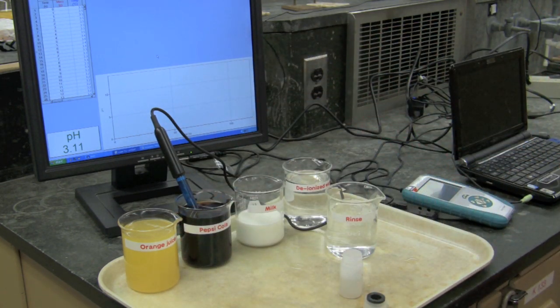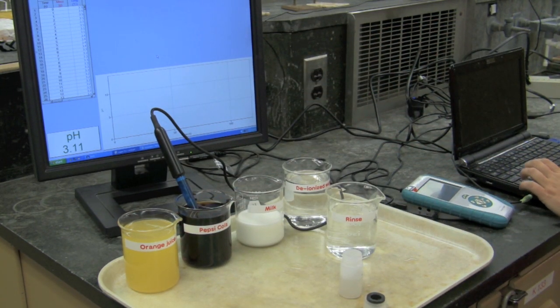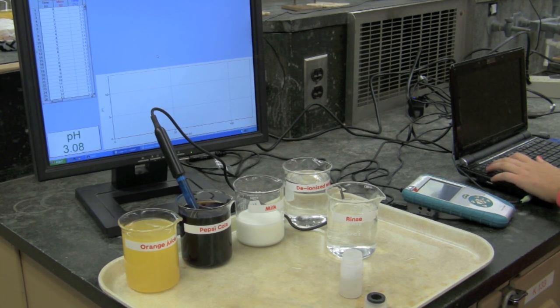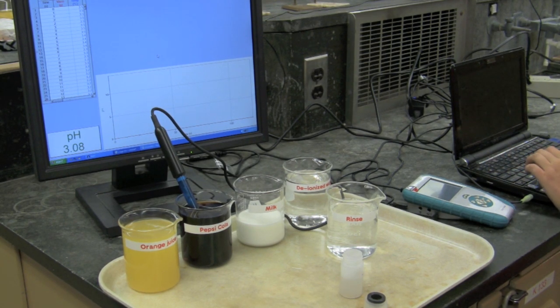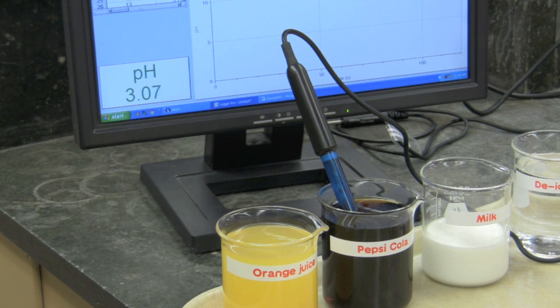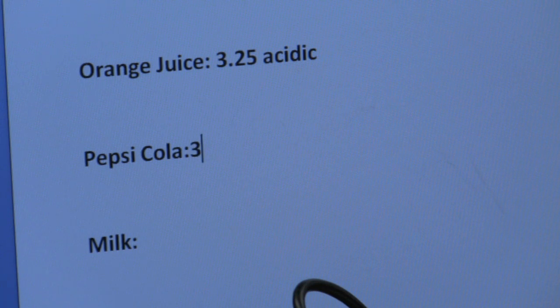She will record the pH again in a Word document and state whether or not the solution is acidic or basic. pH equals 3.08, pH equals 3.06, pH equals 3.05.